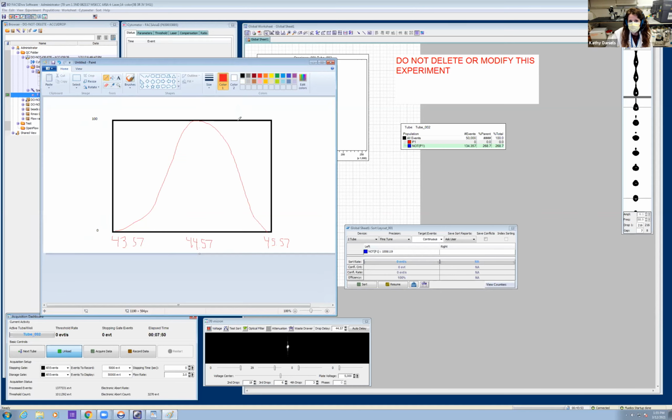I did bring up this little image so that you can get a deeper understanding of what's going on. So this is my beautiful art that everyone gets to see. What we're seeing right now is that we have this drop charge delay that's 44.57. Our aim is to get that as close as possible to 100 for what's showing up in that optical filter to the left, based on the emission of those beads. Then we're checking one value above and one value below, and we want to get as close as possible to 0 here.